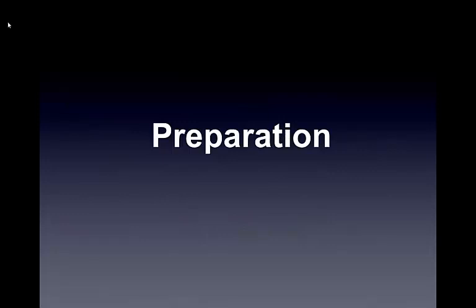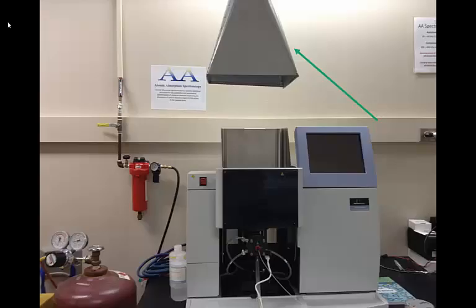Before we can think about starting this instrument up, we need to look at some important safety considerations. In the last lesson, we looked at the hood situated over the atomic absorption spectrophotometer. That hood is there to remove any metal vapors being produced by the instrument, since metal vapors can be very toxic if inhaled. However, just the presence of the fume hood by itself is not sufficient to ensure safety.